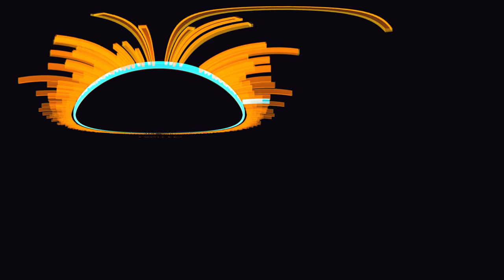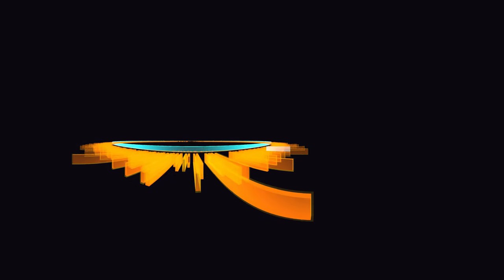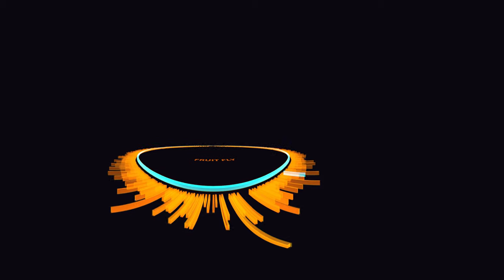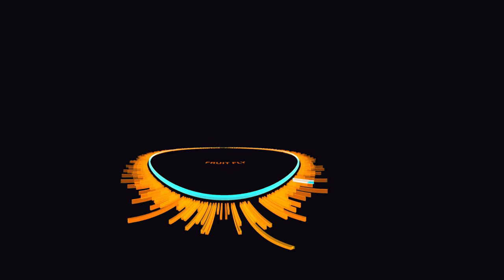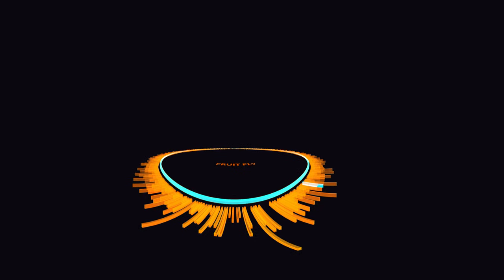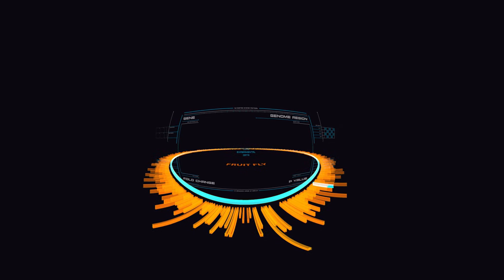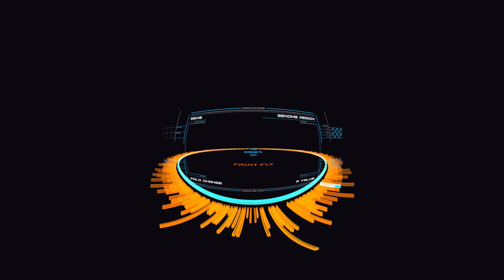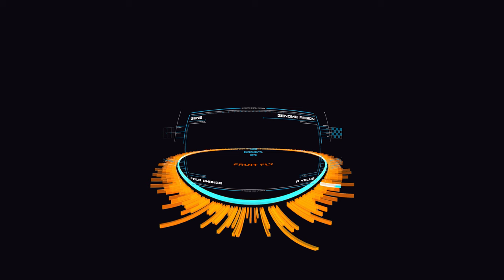The annotations that make up a genome browser are incredibly useful to researchers. However, they tell us what we know already, not what we don't know. Researchers need to load experimental data into this browser so that they can compare, for example, healthy cells with diseased ones, and then find out the differences.